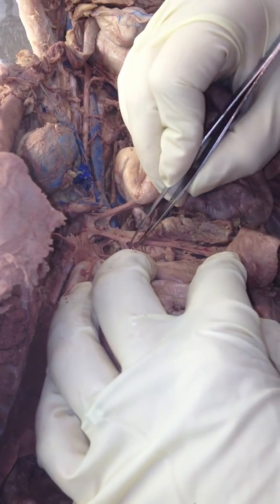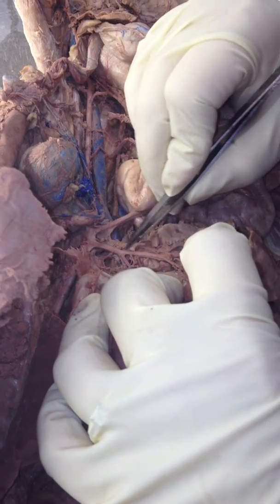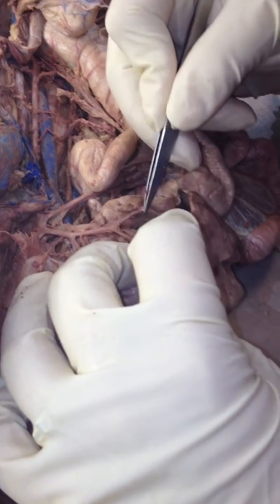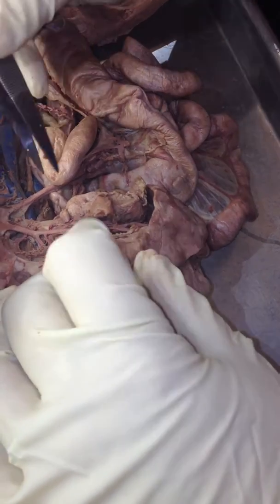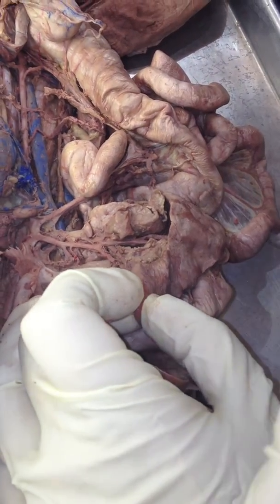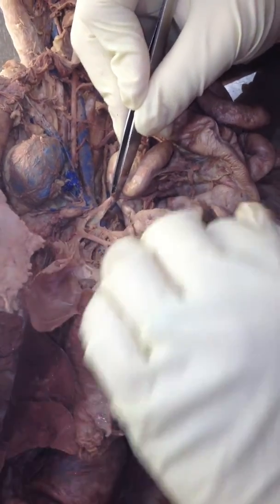And that's then the gastric, just the regular old gastric. And you work your way up here, splenic, which splits into anterior and posterior. Splenic anterior is on top, correct? Okay, because that's anterior for the cat. This is the cranial mesenteric.